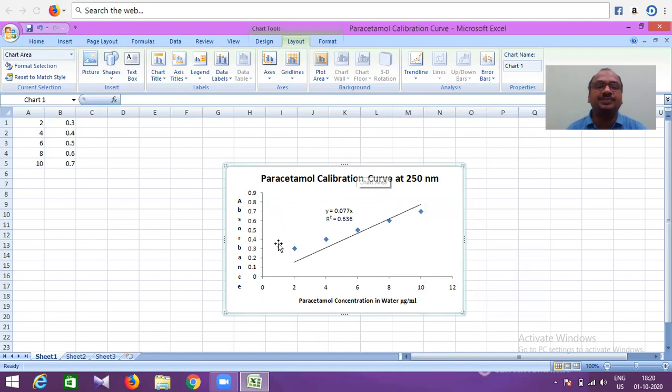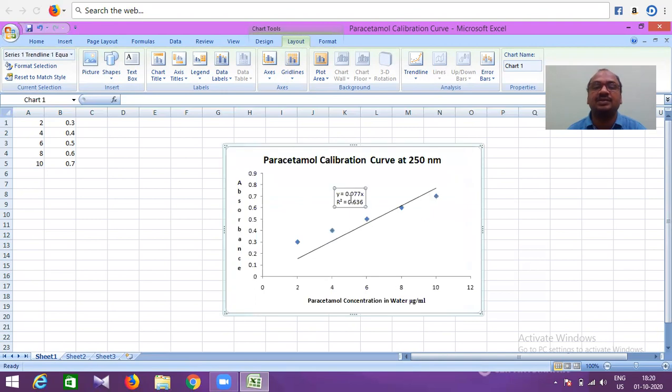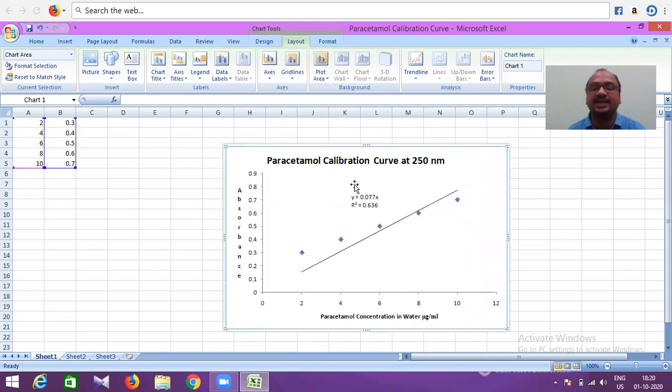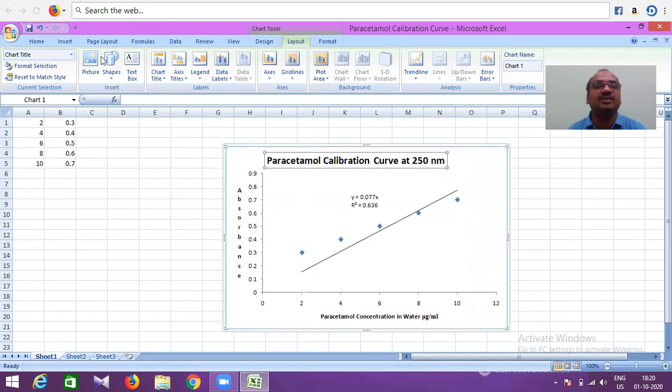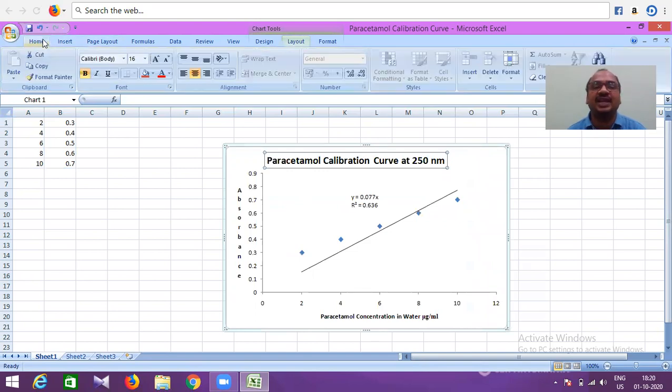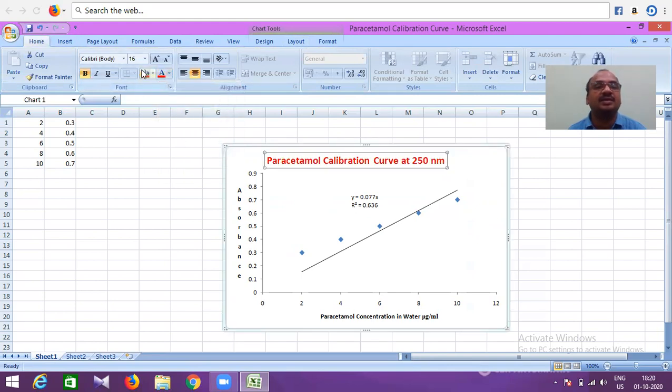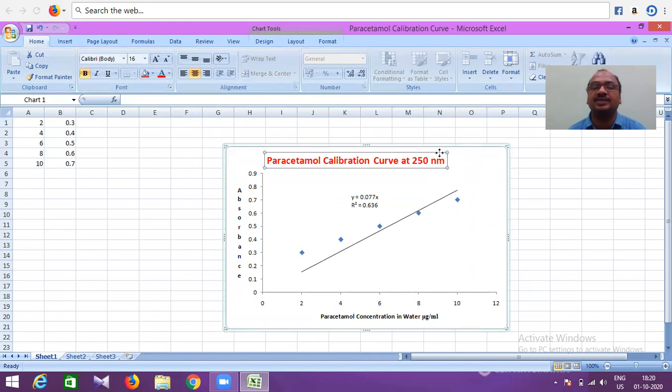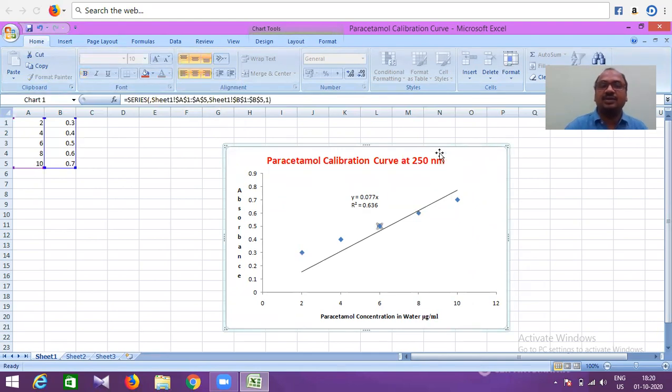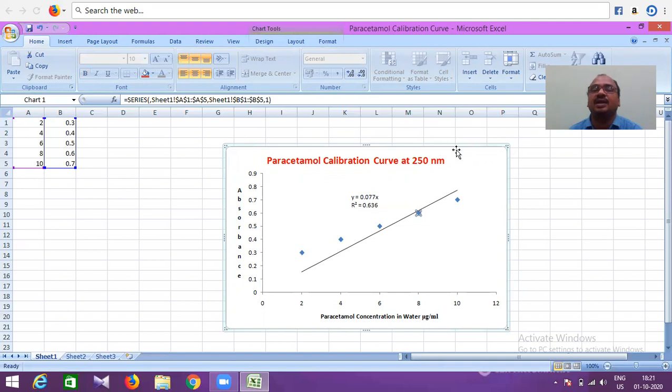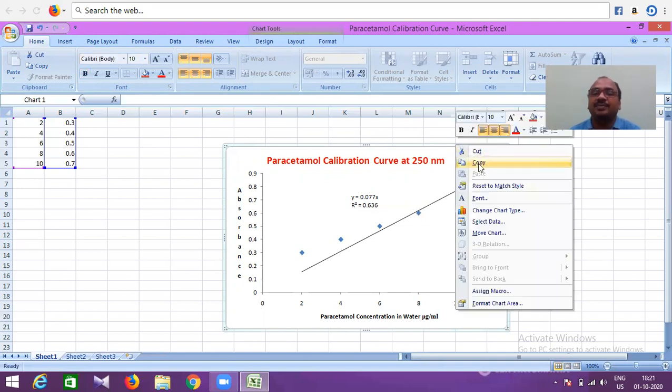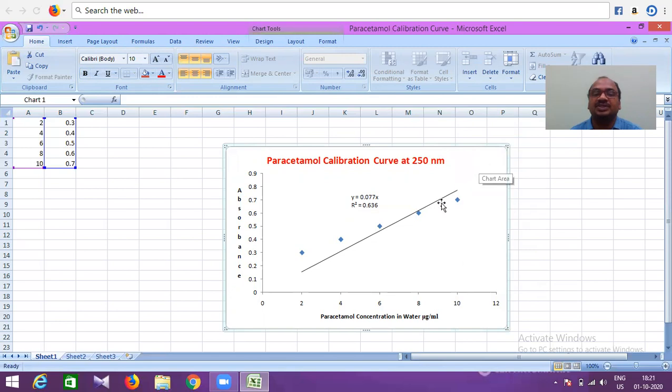You can shift this wherever you want, increase or decrease the size. If you want to change the color, go to Home, select this, and give a red color. You can do it very nicely. Now I got this chart. Now I will copy this entire chart.